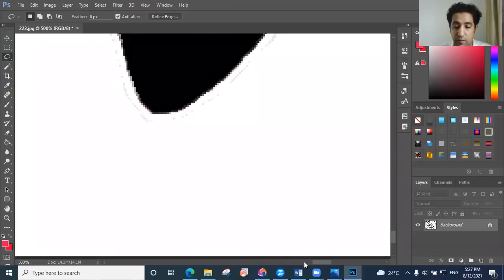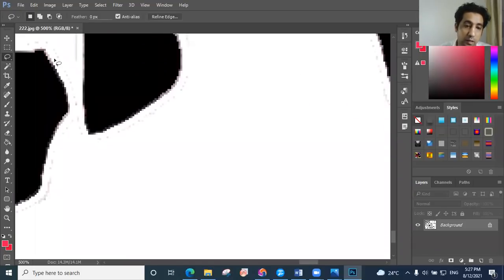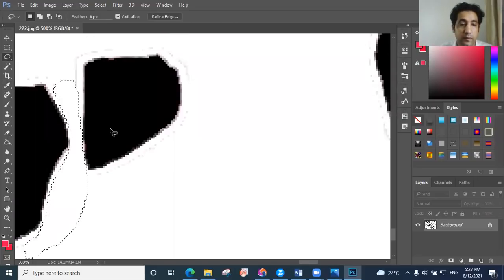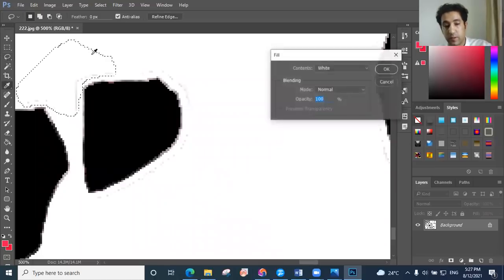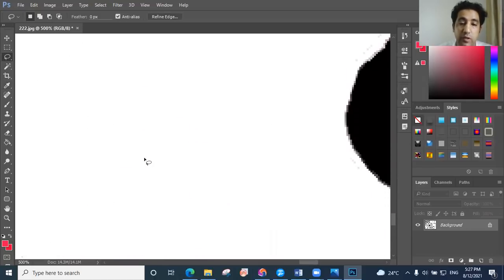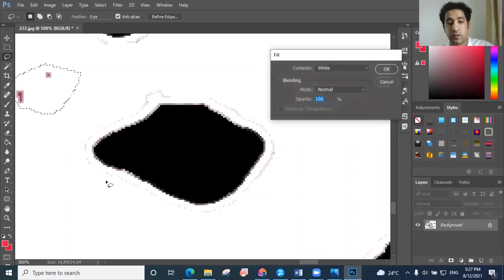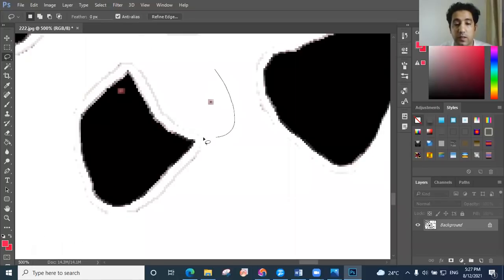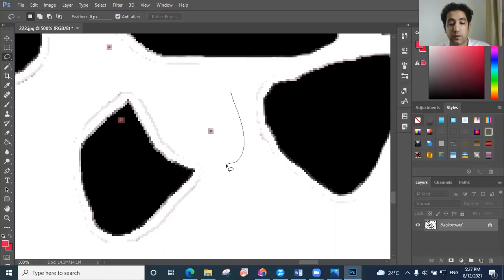All right, then just give another place, another side here. There is say here should be cleared. This line is okay if you don't delete it, because the app will not determine it as a grain. Here, there's a place you need to delete, and this also needs to be deleted. Make sure this line is out of the lens, click here.